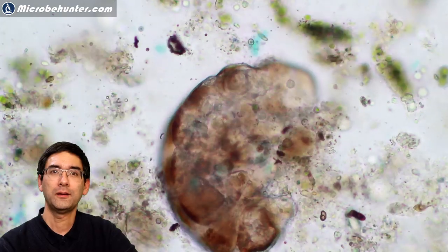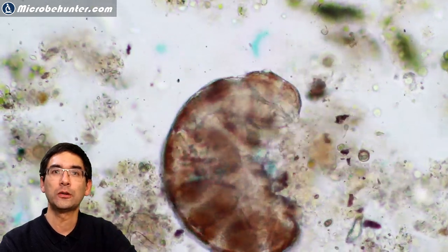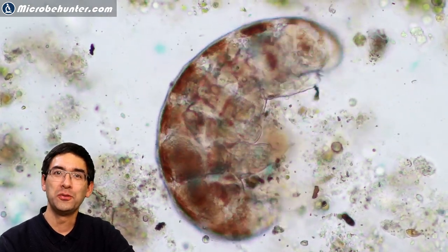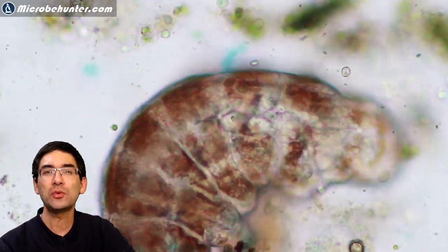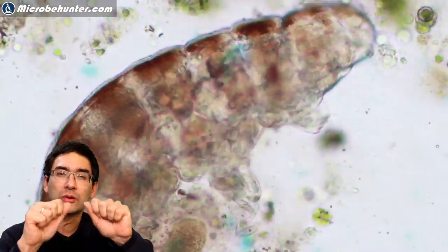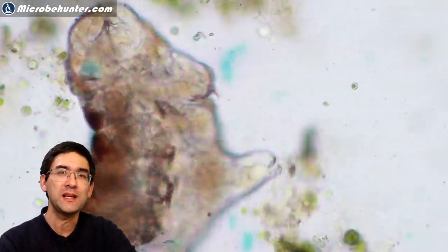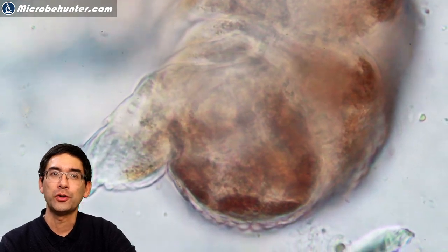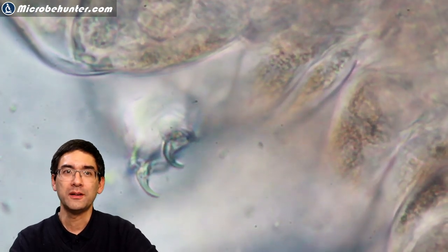Here again at a slightly higher magnification is our little friend. If you look carefully you can now start to see the claws on its legs. It shouldn't be surprising that they use them to crawl around in moss and cling to various surfaces — it might not be so easy to flush them off if they're clinging tightly. So maybe it also makes sense to put the moss sample directly under the microscope. Here we have a large magnification of the claws of this very same tardigrade specimen.